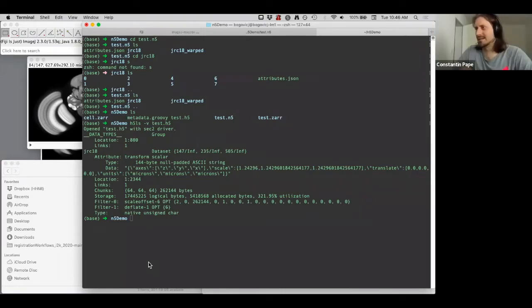I guess this is probably getting pretty technical, but for at least what we have in OME-Zarr, I don't really see issues with mapping it to this metadata attribute dialect of HDF5, because we know, for each field, what types are allowed there.